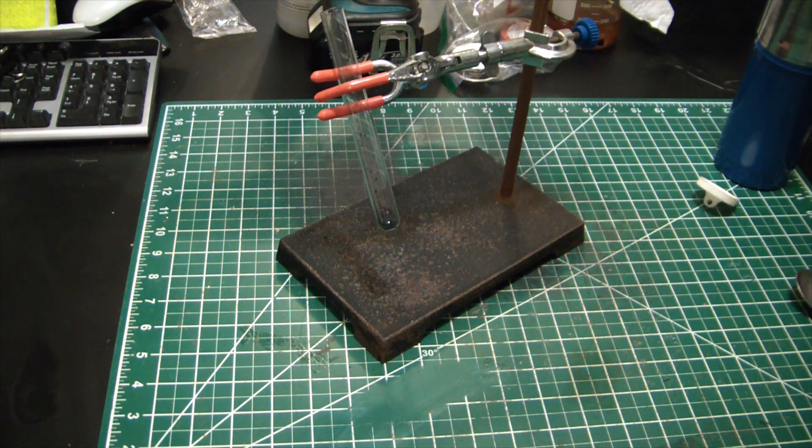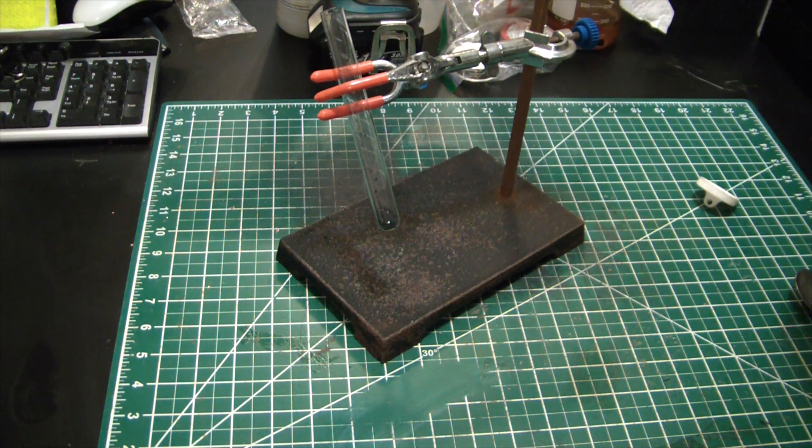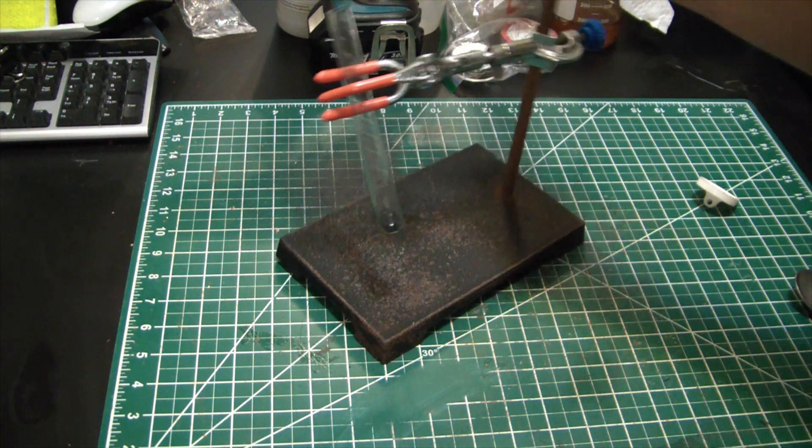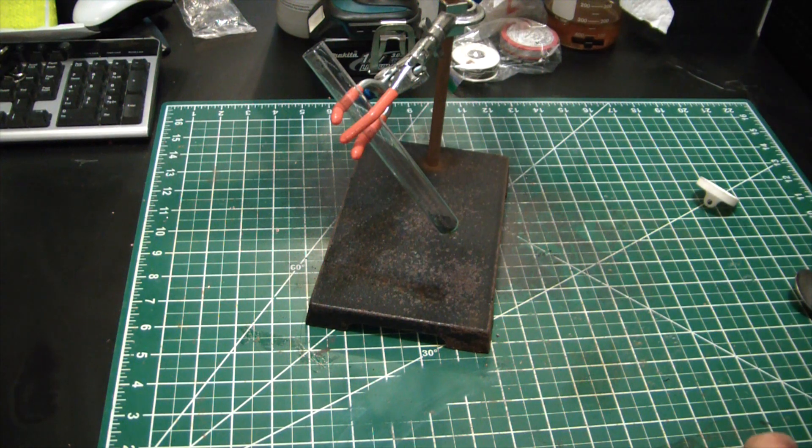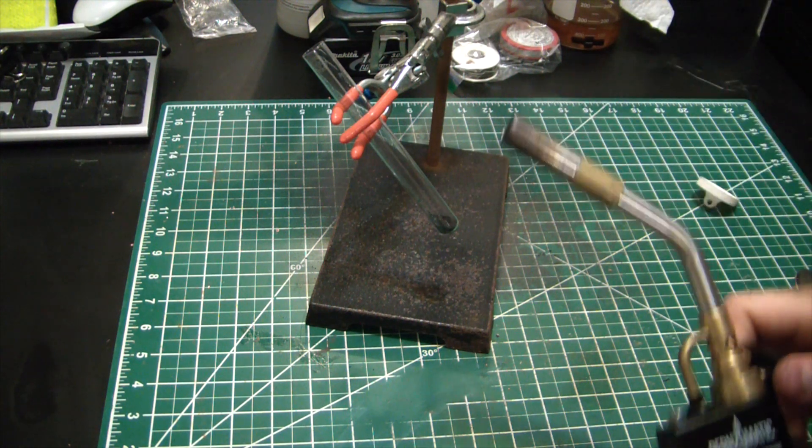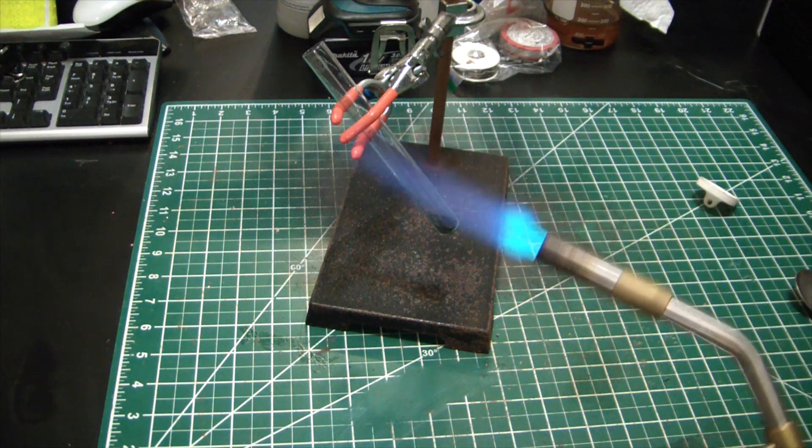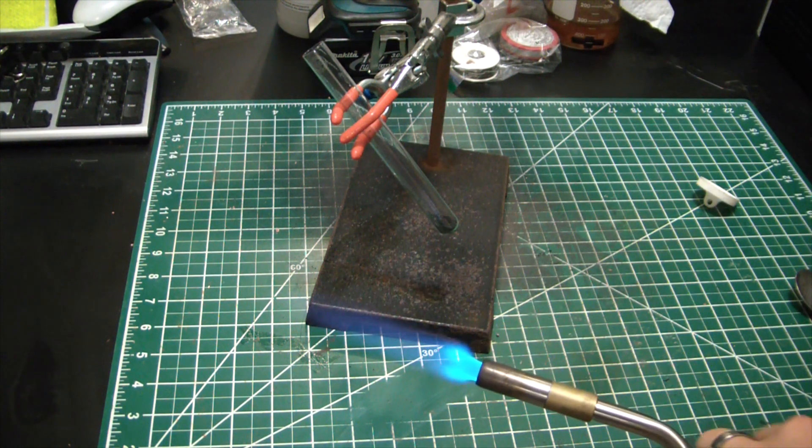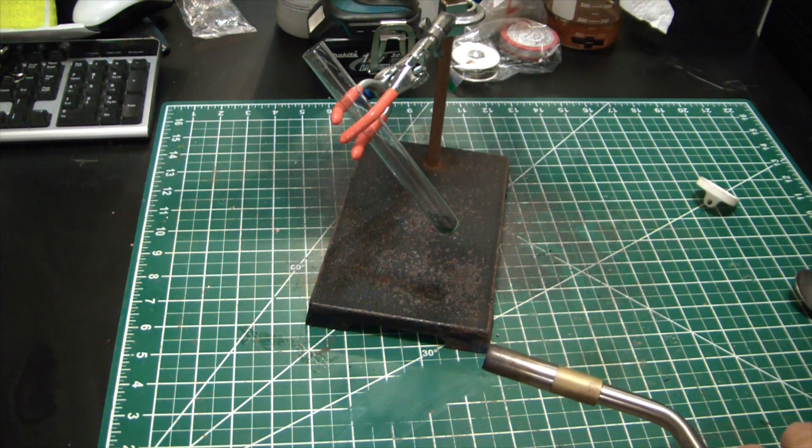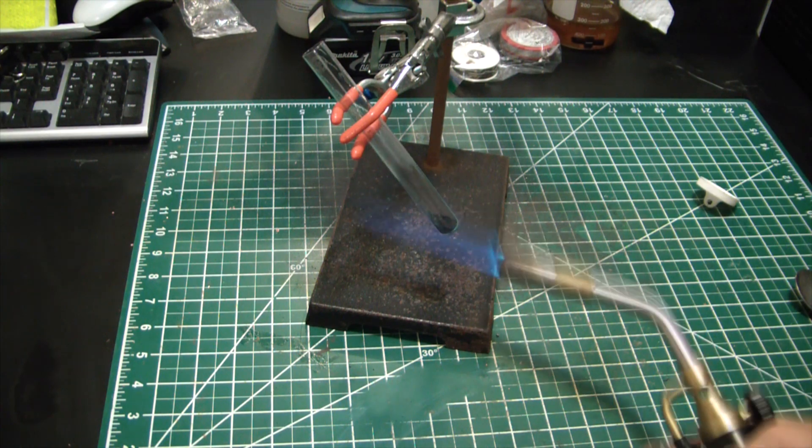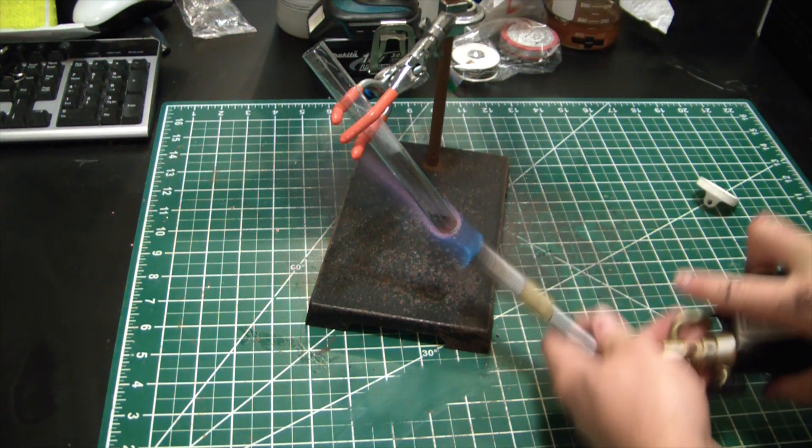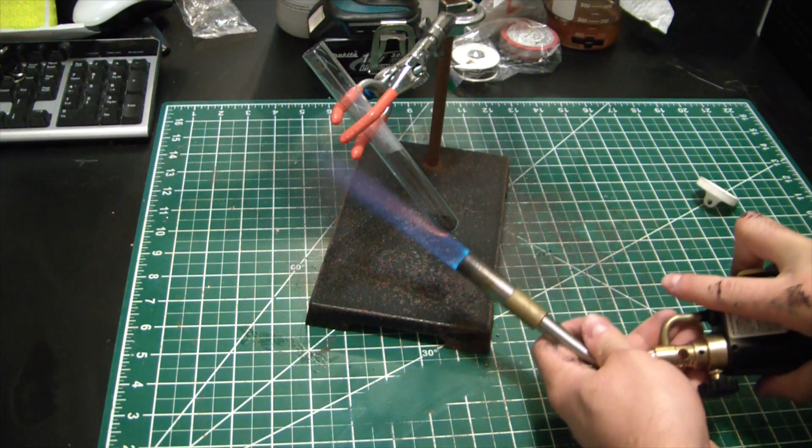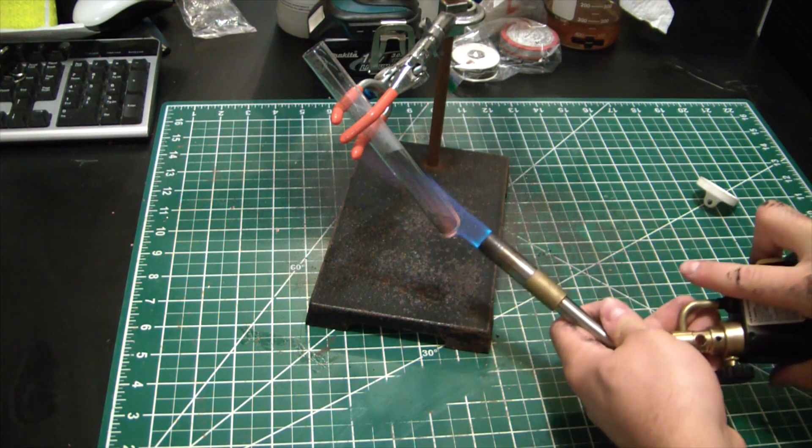Now we're just going to heat the living hell out of it and hope we get calcium carbide. Let's see if it works. Hopefully this doesn't blow up in my face.